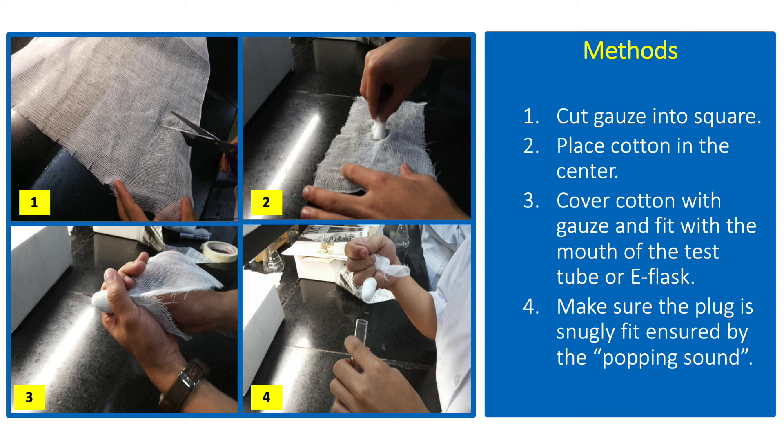To make a cotton plug, cut the gauze into a square depending on the diameter of the tube or flask, then place a lump of cotton at the center. Cover the cotton completely with the gauze and fit it with the mouth of the tube or flask. The plug must have a snug fit — not too tight that it will cause the tube to break, or not too loose that it will fall easily.